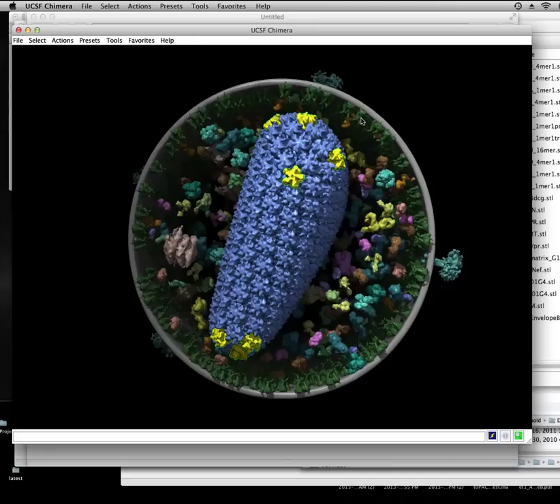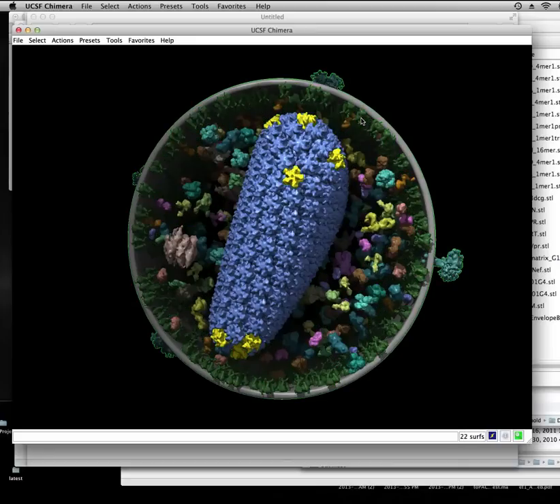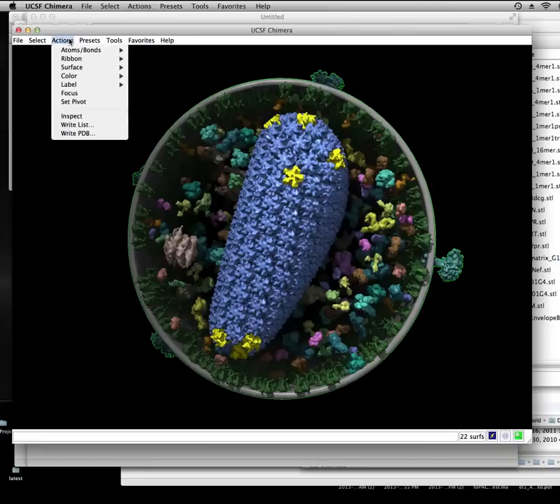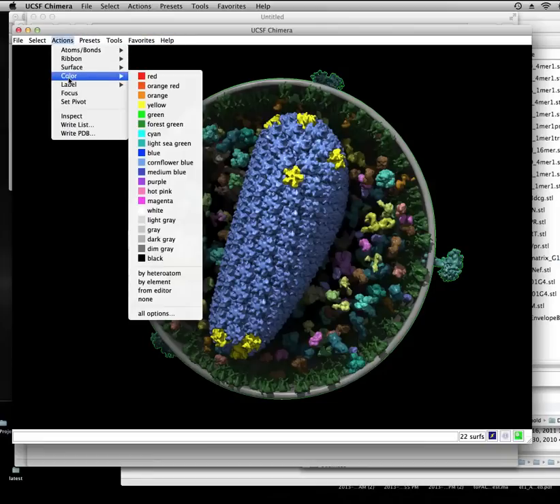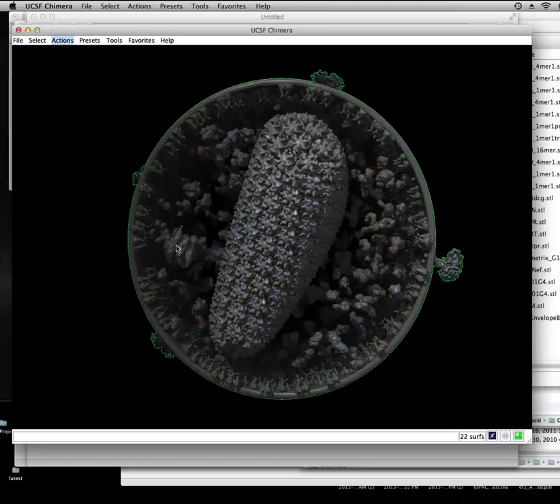But I'm going to start just by making everything gray. I hold control, select one thing, and let's just select the entire object. I'm going to go to Action, Color, Dim Gray.